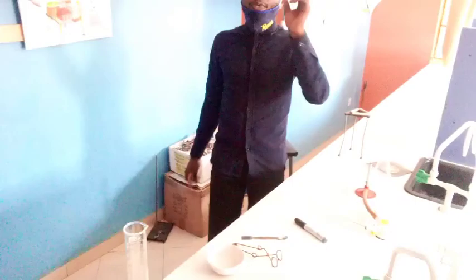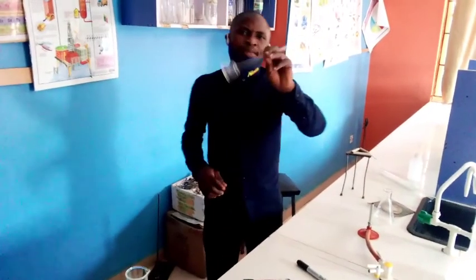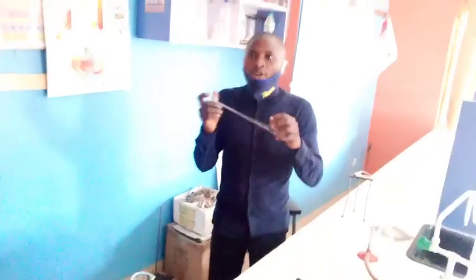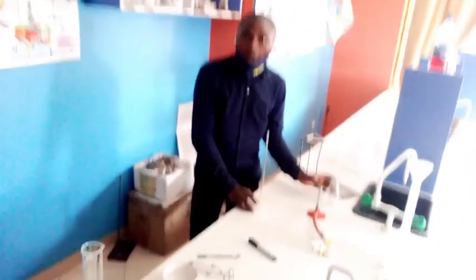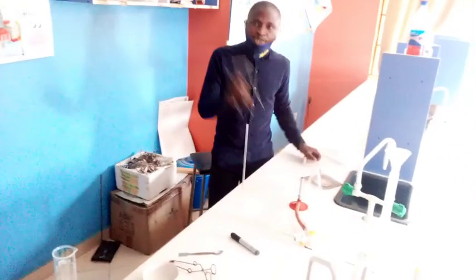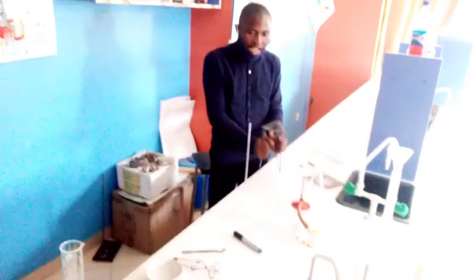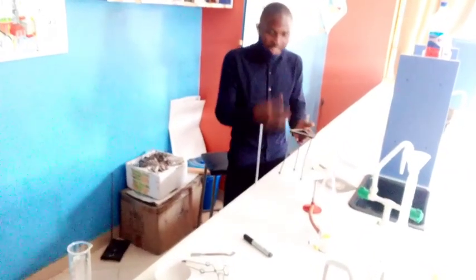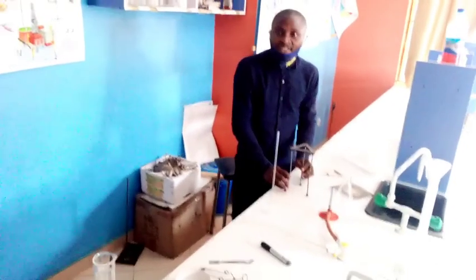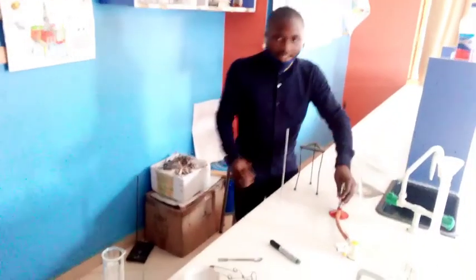And this is called the tap funnel. It is used for the intermittent supply of acids and other liquids to the reaction flask during reactions. Thereafter, we have the tripod stand. This is the tripod stand. It is used to support beakers during reactions. Whenever you are boiling, there's something you have to place the beakers on, and that is the tripod stand. And then we have the Bunsen burner. This is the Bunsen burner.